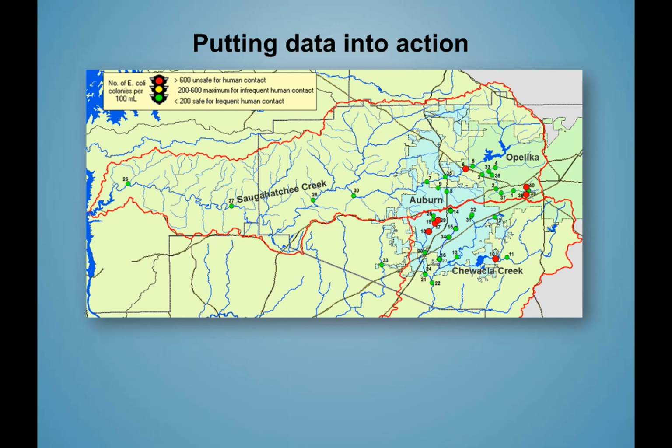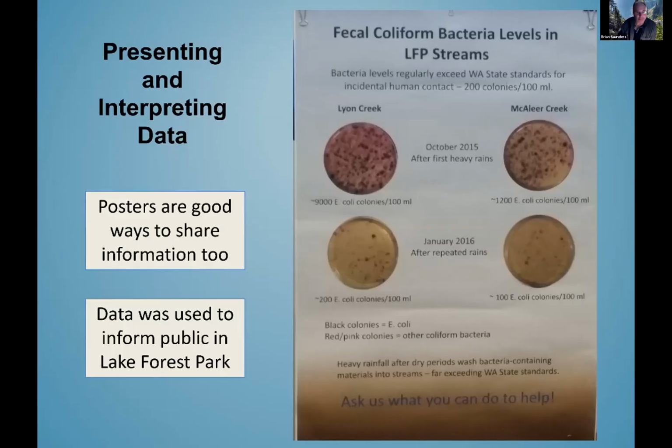Another case. Hey, Eric. Yeah. Sorry. I know that these are just pictures, but it did raise a question I had. How long does the E. coli remain purple? Let's say I needed to count it at a different time, how long could I wait before I have to make a count for sure?